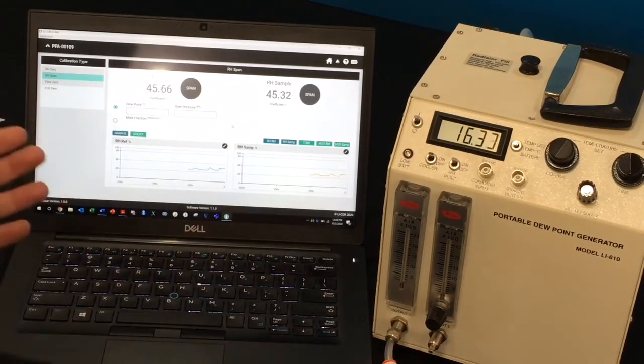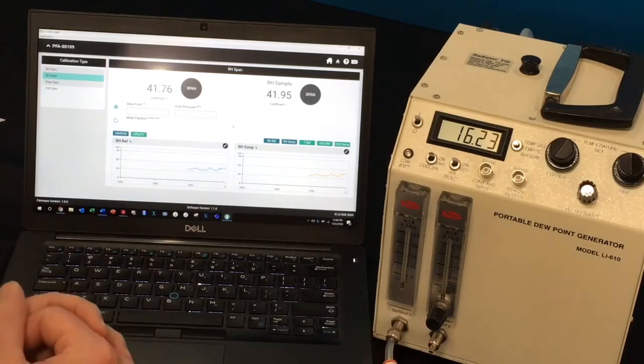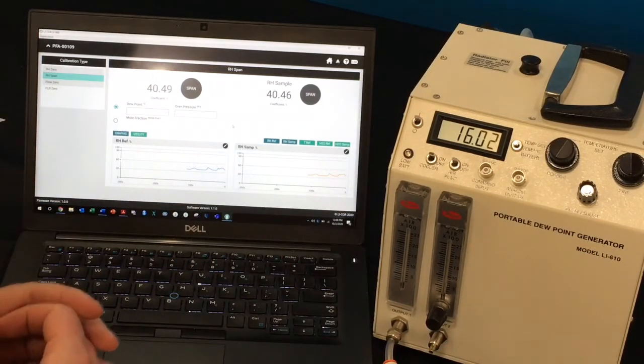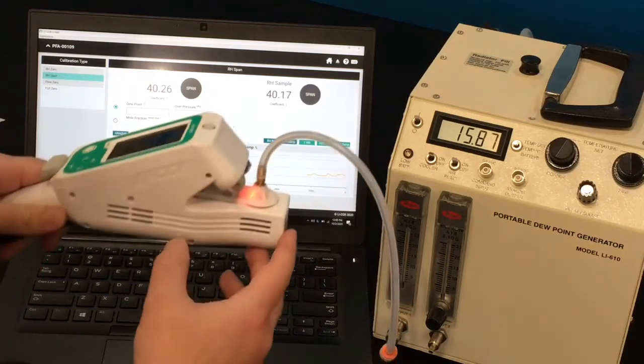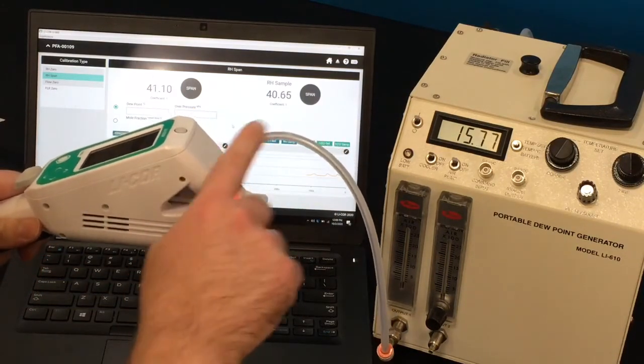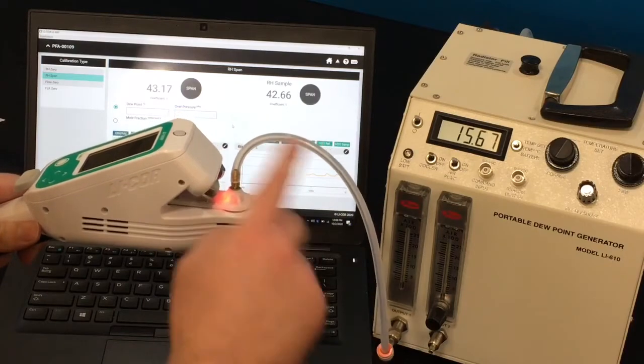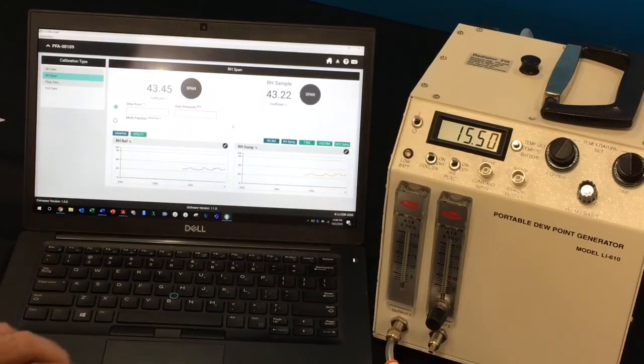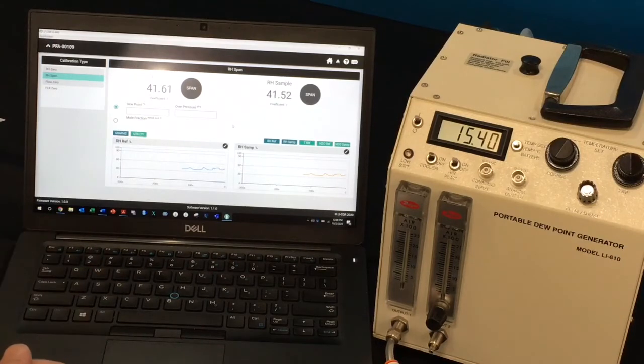But you'll want to let this dew point generator run for about 30 minutes just to make sure that all of the water vapor gets flushed out of the tubing and into the instrument itself. You also want to make sure that you use as short of tubing as possible between the two instruments so that water vapor does not stick to the tubing as much.